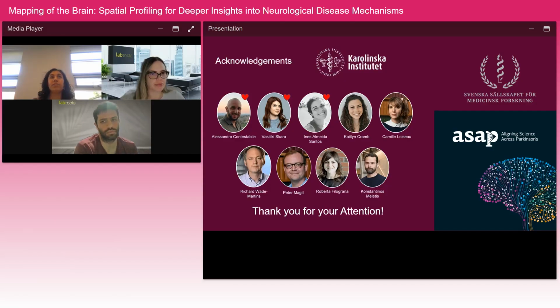The tissue size doesn't matter. However you do your histology is sort of how you define your tissue size. You can put multiple sections during histology onto a slide. But the maximum imageable area on the system is 3 centimeters squared. However you use that 3 centimeters squared is very flexible. And depending on how adept your histologist is, you can really pack in that 3 centimeters, or you may be able to fit your whole tissue on there.